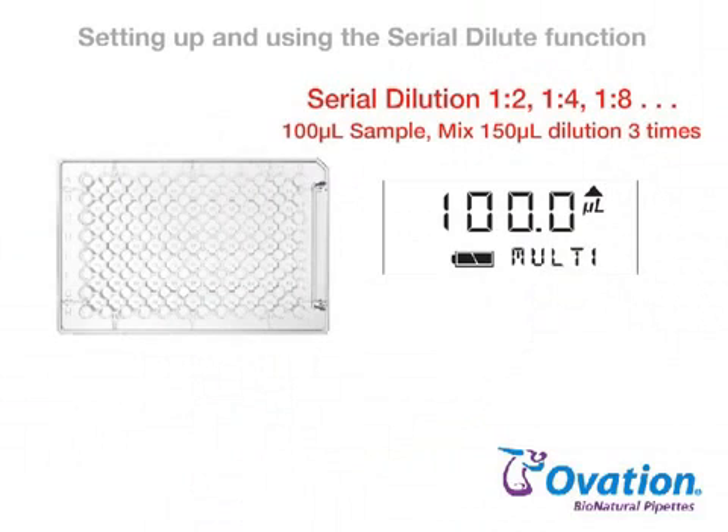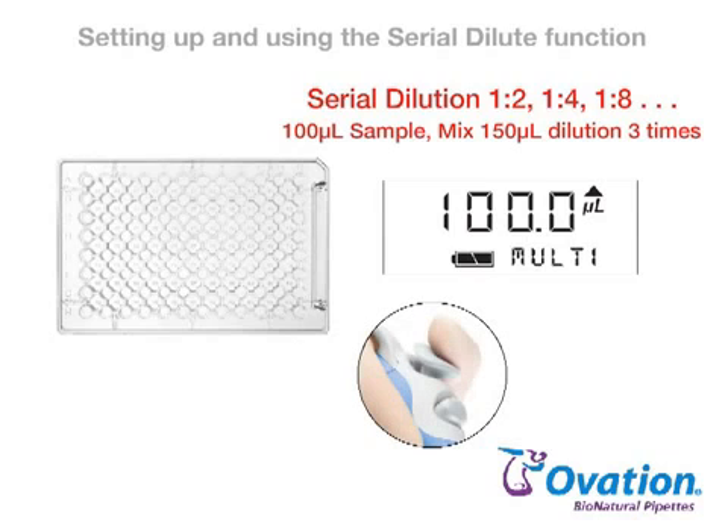For this example, we'll prepare a 1 to 2, 1 to 4, 1 to 8, etc. serial dilution using a sample volume of 100 µL. We'll mix 150 µL of each dilution three times. Prior to setting up and running the Serial Dilute function, use the Multi-Dispense liquid handling function to dispense 100 µL of diluent into each sample well.